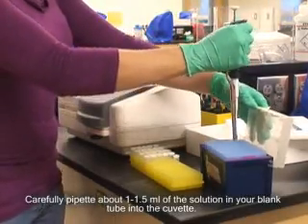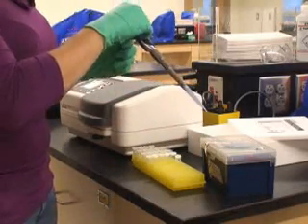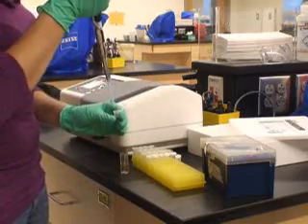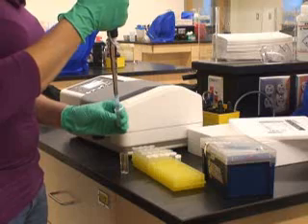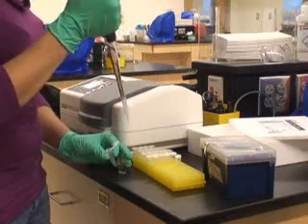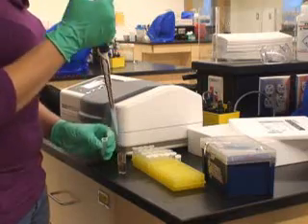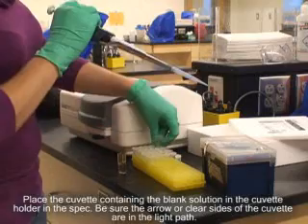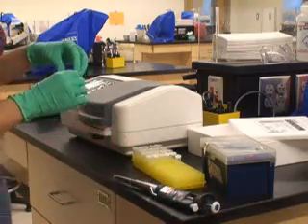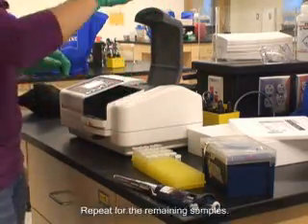Carefully pipette about 1 to 1.5 milliliters of the blank solution into the cuvette. Place the cuvette containing the blank solution in the cuvette holder in the spectrophotometer. Be sure the arrow or clear sides of the cuvette are in the light path. Read the samples at 595 nanometers and repeat for the remaining samples.